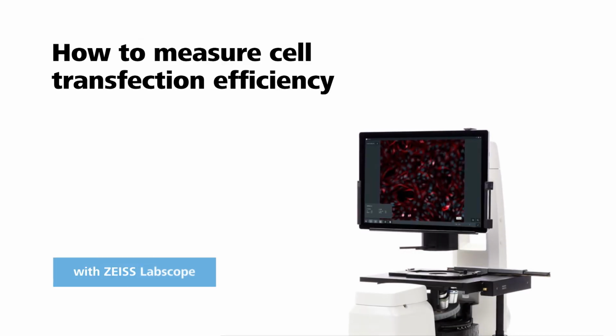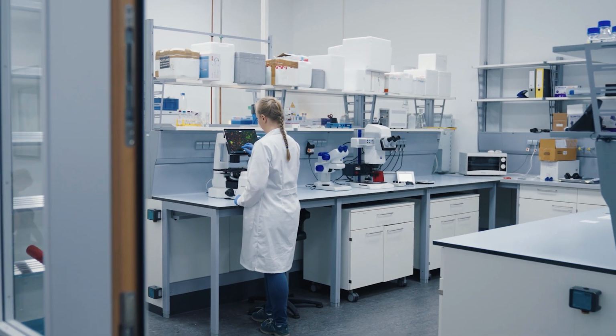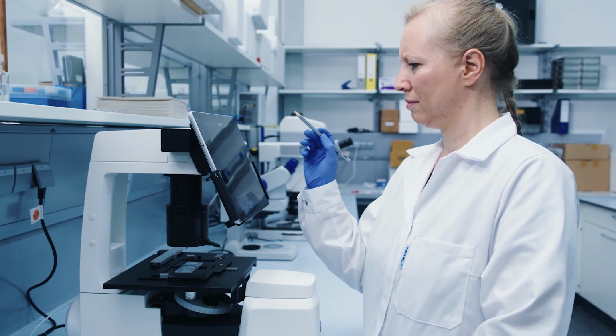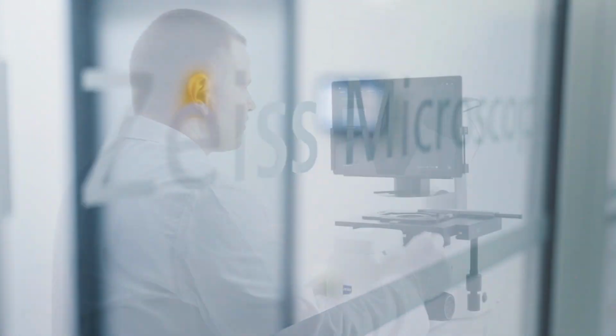How to measure cell transfection efficiency with Zeiss Labscope. Knowing how many cells were successfully transfected is crucial for reliable experiments. Manual analysis can be slow, subjective, and error-prone.